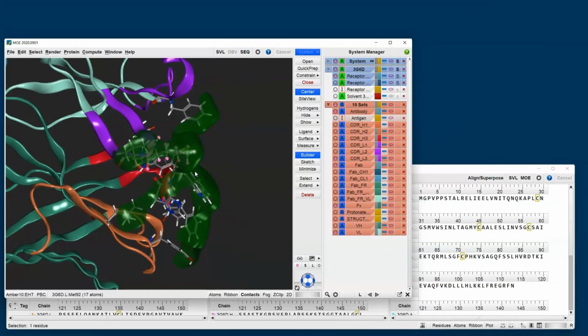So just a quick recap, that we found a residue that could be linked to liability. It also happens to be hydrophobic and therefore could affect solubility. So for these reasons, we might want to mutate this methionine to another residue. The question then becomes, to which residue do we want to mutate?